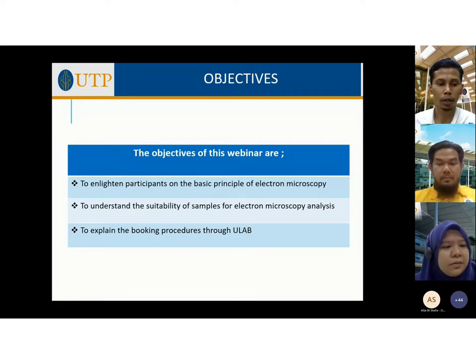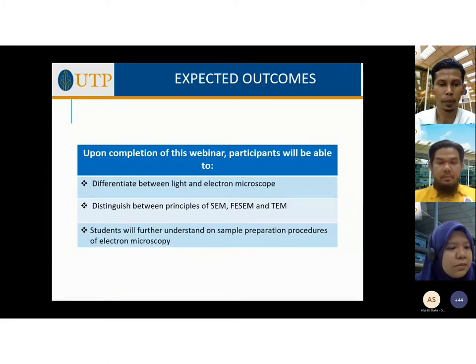Furthermore, these are the expected outcomes. Participants will be able to differentiate between electron microscopy, distinguish between principle of scanning electron microscope, SEM, field emission scanning electron microscope, FESEM, and transmission electron microscopy, TEM. And students will further understand sample preparation procedures of electron microscopy.